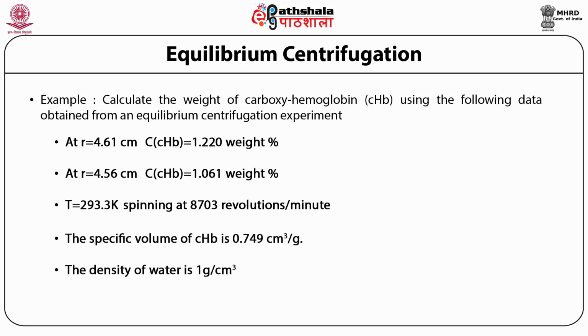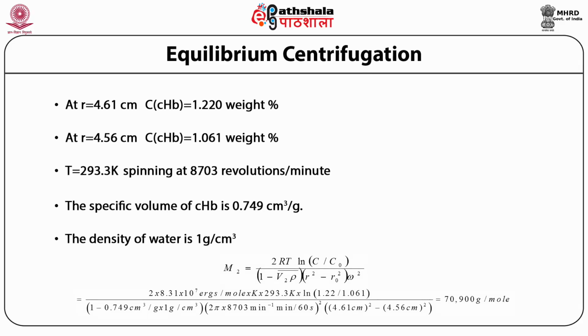So if you have the values of all these things, the molecular mass can easily be calculated using this equation for equilibrium centrifugation. Here is another example of calculating the molecular mass of hemoglobin under different conditions, and all the values are given here for the mathematical expression.